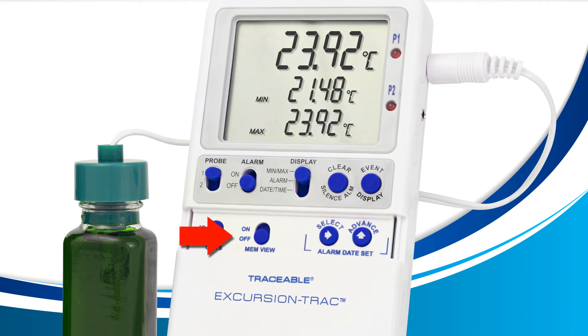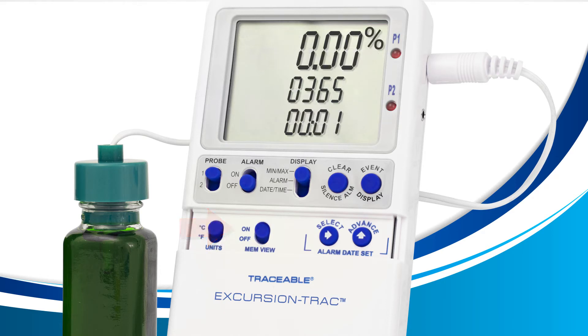Go ahead and move this switch up and your LCD will change. The top row of your LCD tells you how much of the memory is currently full. The middle row tells you how many more days it can record before it becomes full. And the bottom row tells you the logging interval currently set.